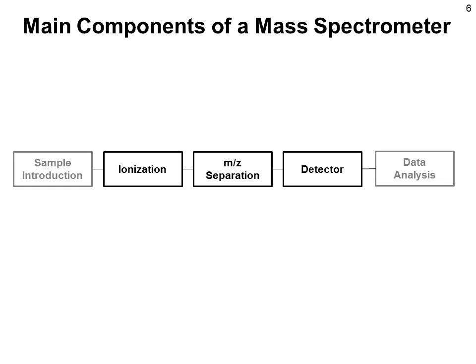Let's thus look very briefly into the main components of a mass spectrometer. It actually looks quite simple. First of all, you need to introduce your sample into the mass spectrometer. This is often not considered part of the mass spectrometer as such. This could be a simple syringe pump, an injection valve, or, in our case, mostly a liquid chromatograph.